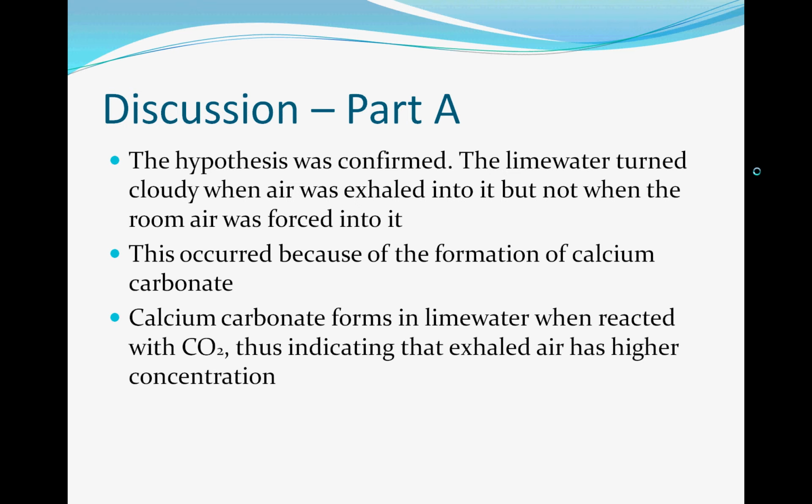So, in Part A, the hypothesis was confirmed. The lime water turned cloudy when air was exhaled into it, but not when room air was forced into it. This occurred because of the formation of calcium carbonate. Calcium carbonate forms in lime water when it's reacted with CO2. When the reaction occurred, it indicated to us that there was a high CO2 concentration in the lime water.